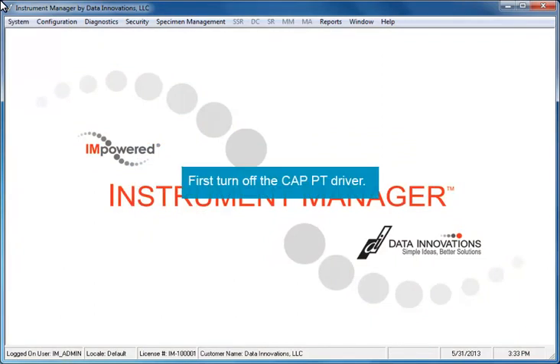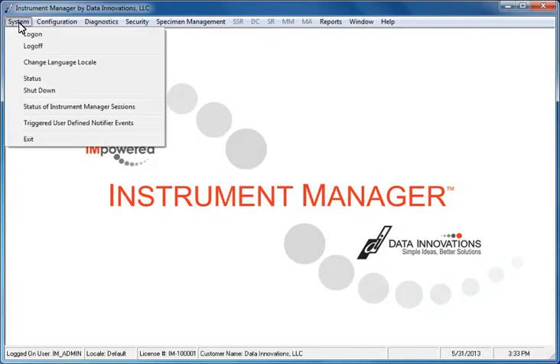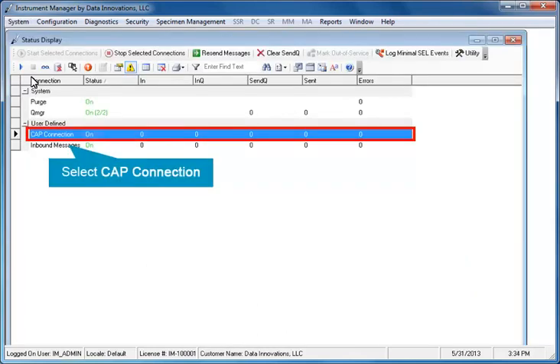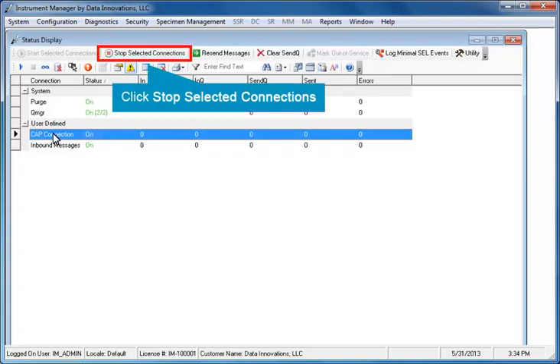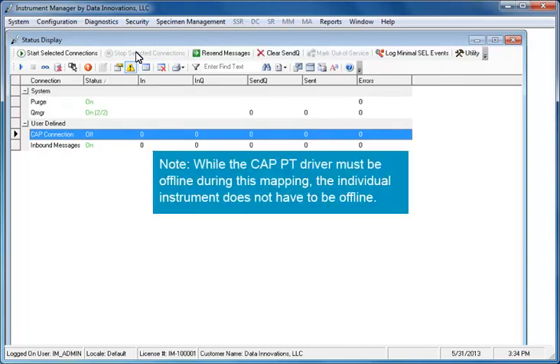Before you can map codes, you must first turn off the CAP PT driver. Open the System menu and select Status. In the Status Display window, select the CAP connection and click the Stop Selected Connections button. The connection status changes from on to off. Note that while the CAP PT driver must be offline during this mapping, the individual instrument does not have to be offline.